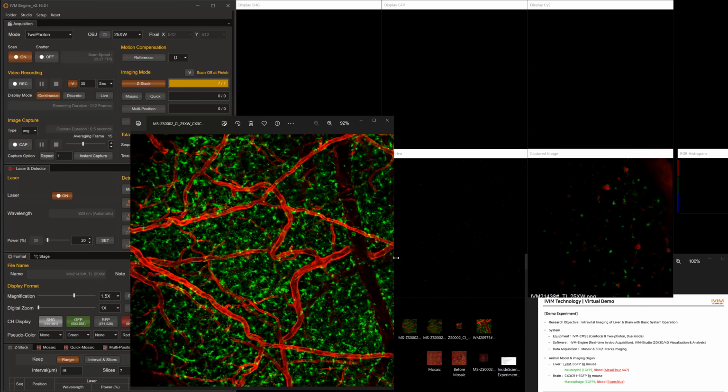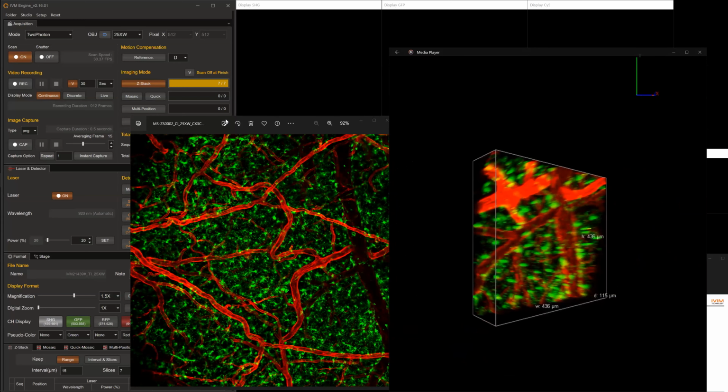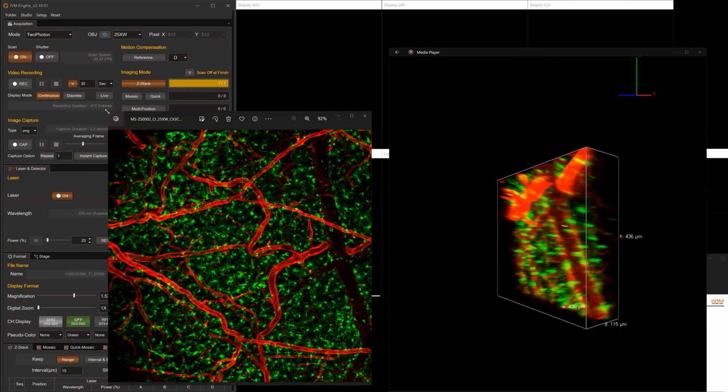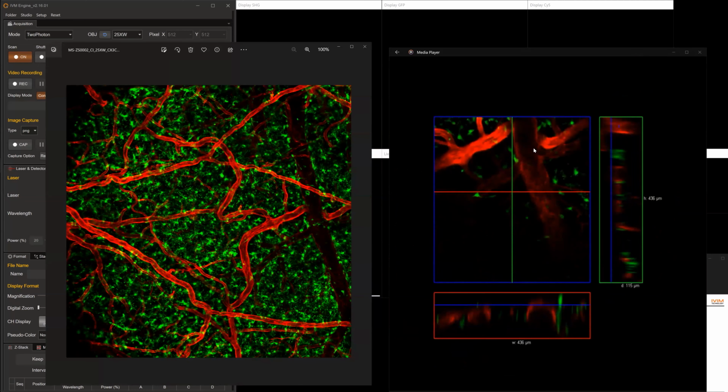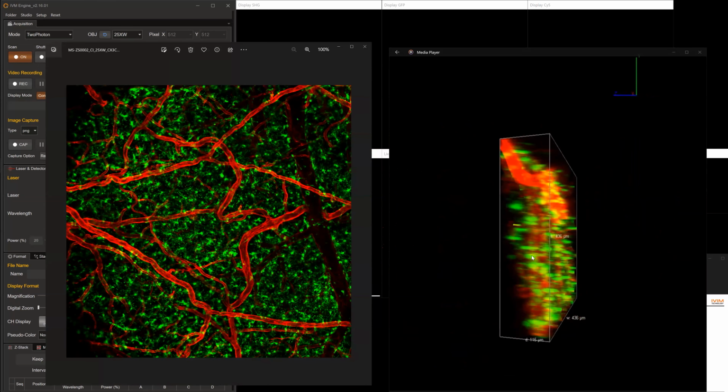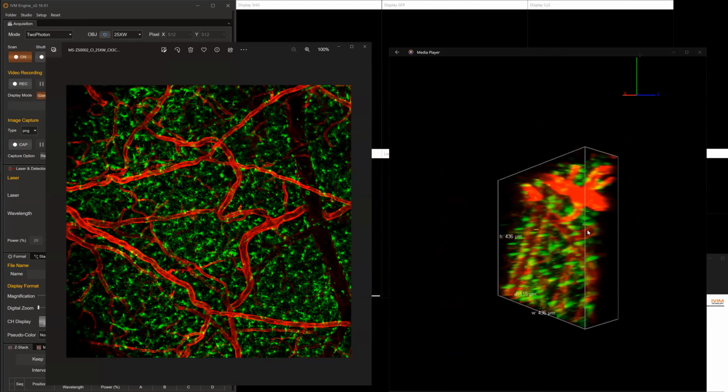On the left side of the screen, 5 by 6 mosaic images in the width and length way of the brain. On the right side comes the extracted video of 3D data, which is the 21st mosaic image from the large map.